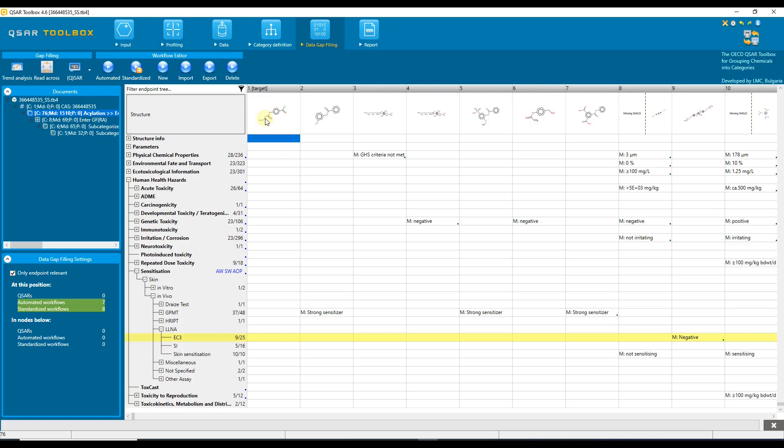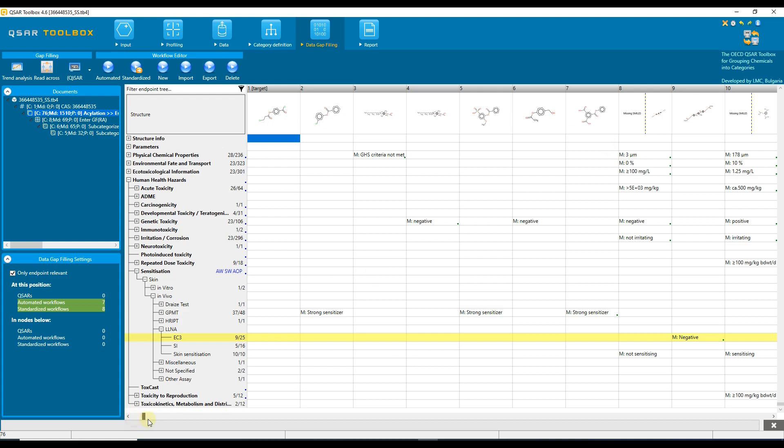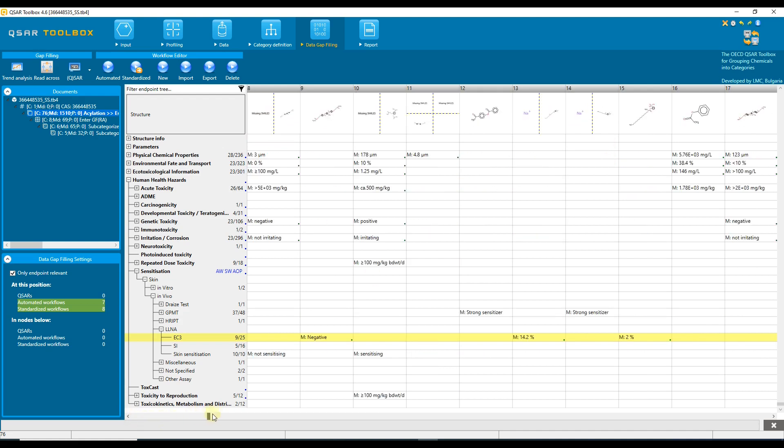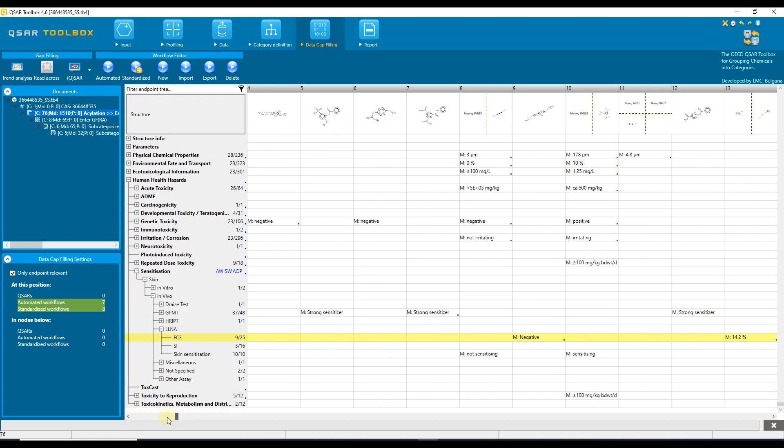Subcategorization is the process of refining the initial category by applying relevant to the target endpoint profilers. The process of categorization consists of defining the primary group and further refining the primary group by eliminating dissimilar chemicals.